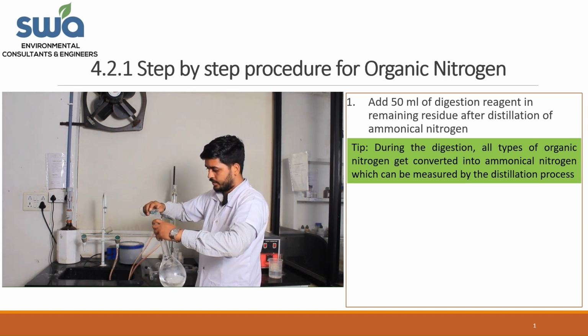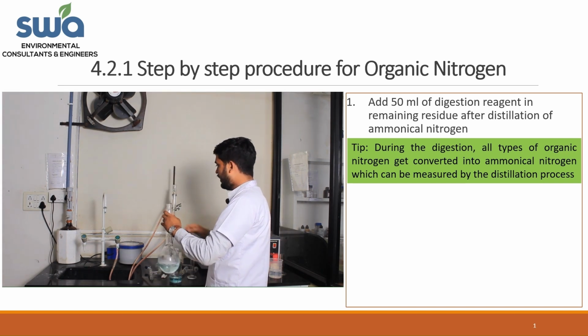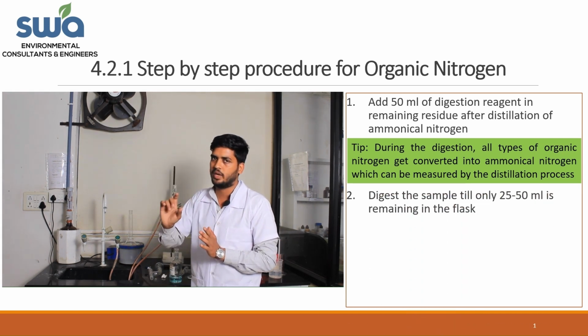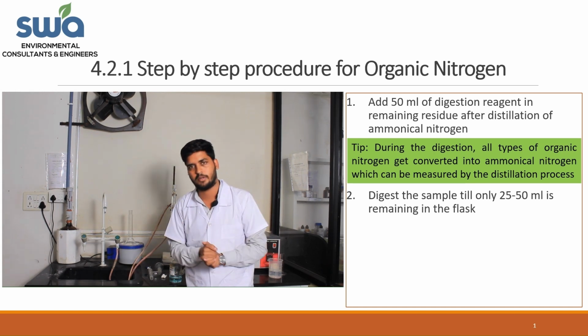slowly, and let the sample get digested till 25 to 50 ml of the solution is remaining in the distillation flask. After that we will move further.